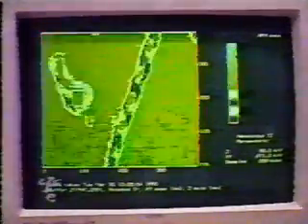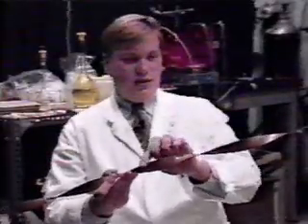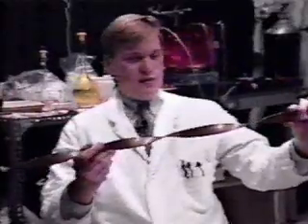With the atomic force microscope, we produce an image which is similar to a twisted ribbon, in which there is a continuous structure, continuous flat structure, which twists upon itself. Michael Polanin is describing the shape of protein filaments which assemble in the brain cells of Alzheimer's victims.